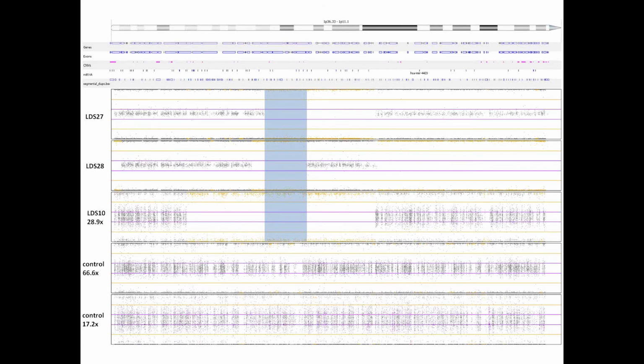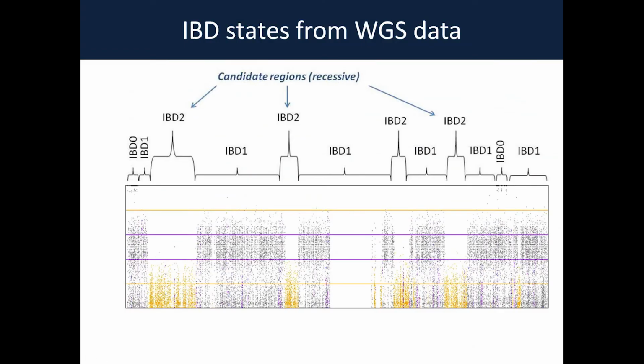Another thing we played with, once we'd developed a way of getting good B-allele frequency type plots from whole genome sequencing data, was this: in some families where we have two affected siblings, we thought, what happens if you do a subtraction and plot the absolute difference between your B-allele frequency score for each SNP along a chromosome?